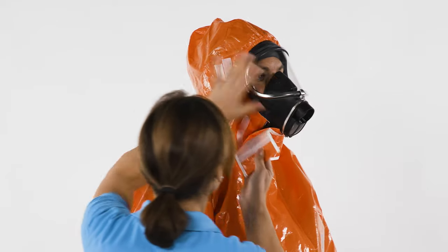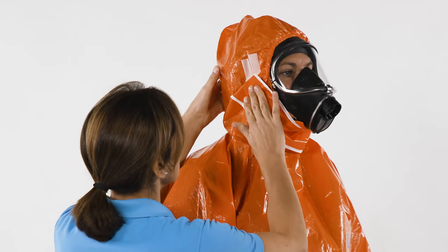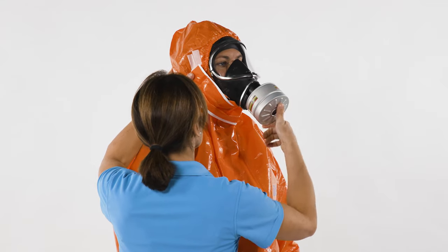Close the chin flap between hood and mask. Place one strip on the other strip. Then attach the breathing filter to the full face mask.